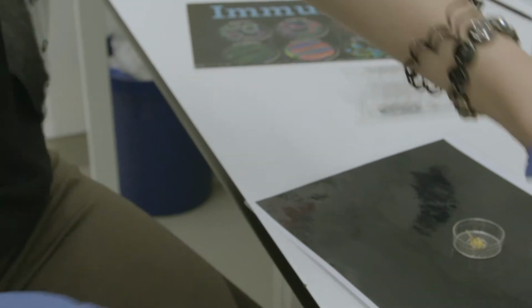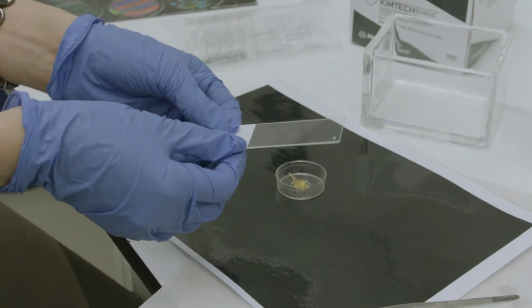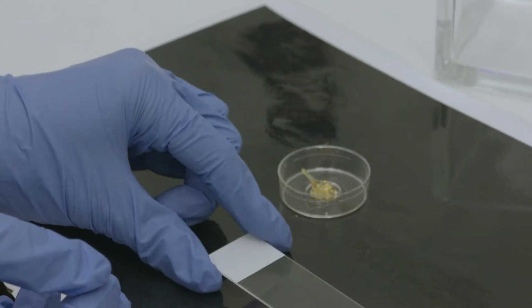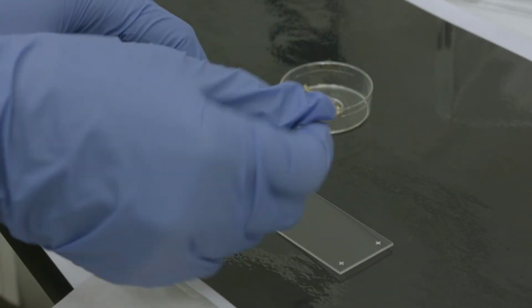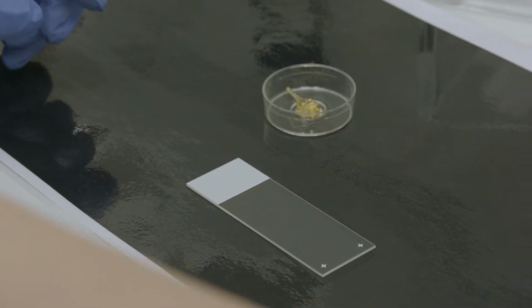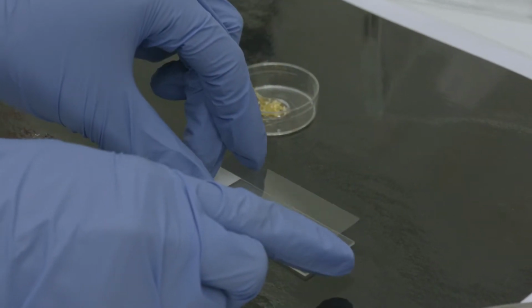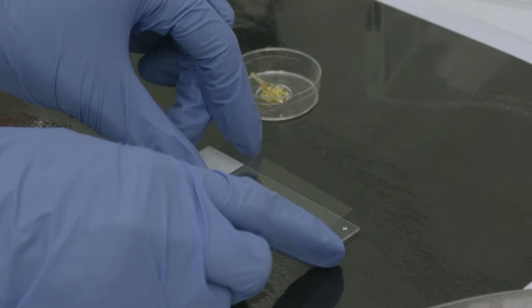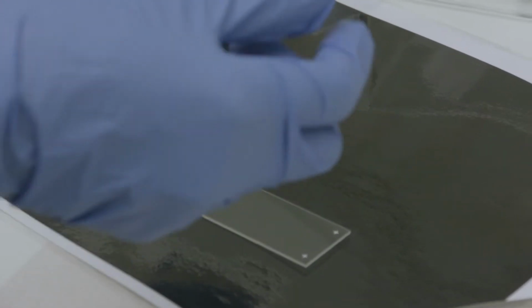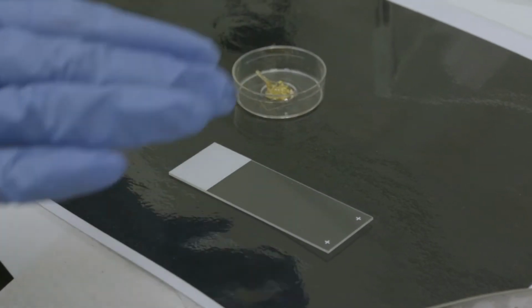Okay, the other way of mounting is a little bit more tricky and you have to be more careful. You take a glass like this. This is normal histology glass. Then you have to design a pool to put your sample in and cover it with BABB to keep it transparent. In the end, you have to seal your pool with a cover slip, like normal histology. But because now you have a thick sample, you have to create a wall here to have volume, right? So this is more tricky because you have to be 100% sure that there is no BABB coming out, no leakage.